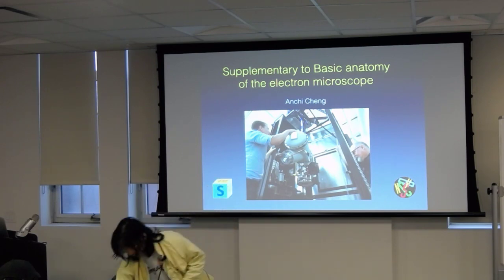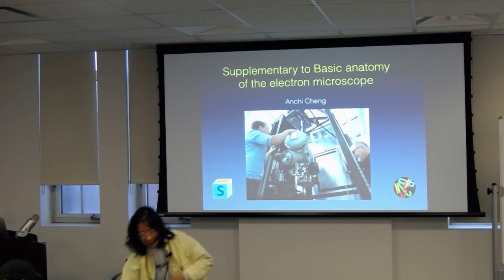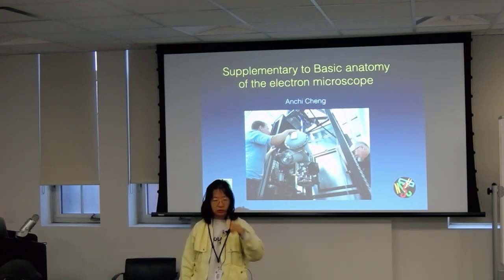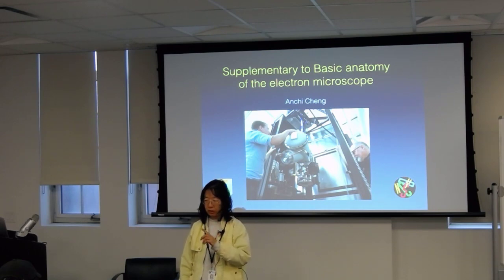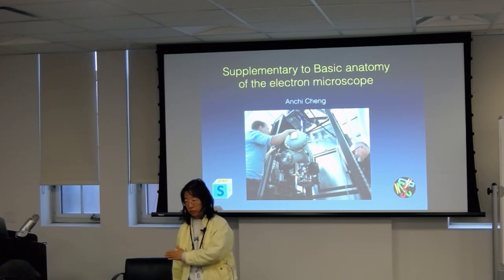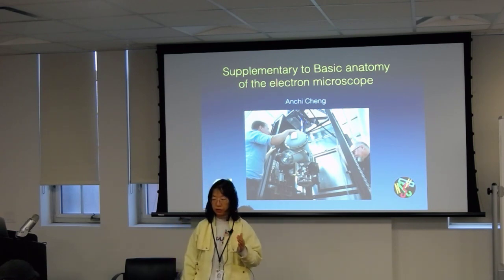Okay, so one of the things that we are covering here has a lot to do with the microscope, the lens and all those things. In Grant's lectures, he explained a lot about what an optical lens is, and what a lens used in an electron microscope is, and how they are different.